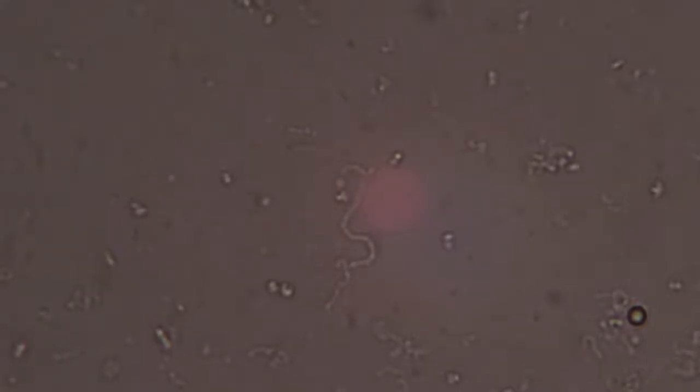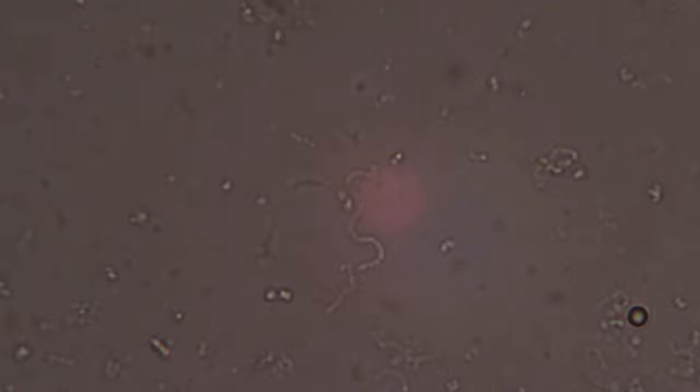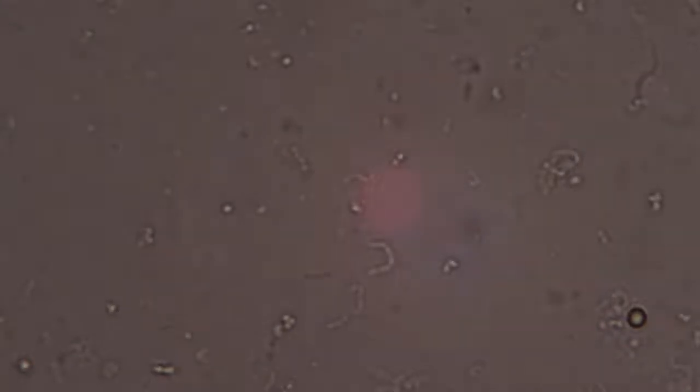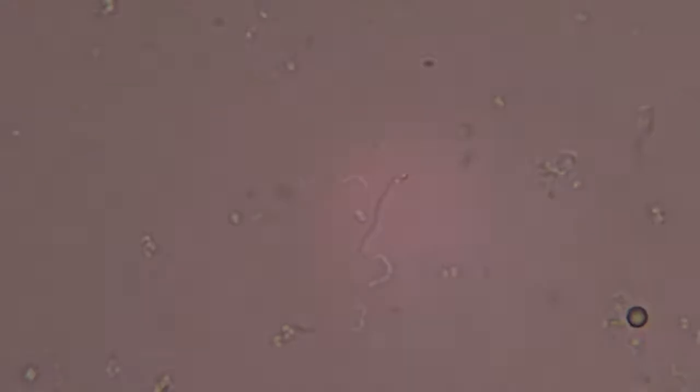Helps to defocus them a little bit so you can see the shape. Change the light just a little bit, should make it pop. See if I can oblique light it. There we go. Get a little 3D action.